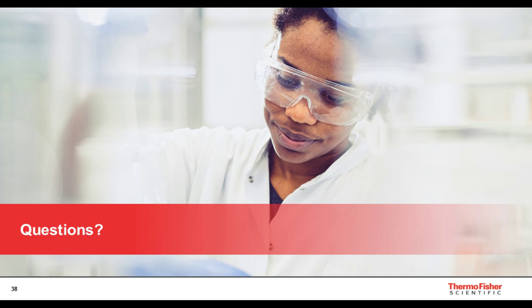Thank you. And we'd have to wrap with this final question. How long can you keep the solubilized GPCR stored and stabilized? So I show data for 1 week at 4C and up to a month at -20C. We have extended those studies.